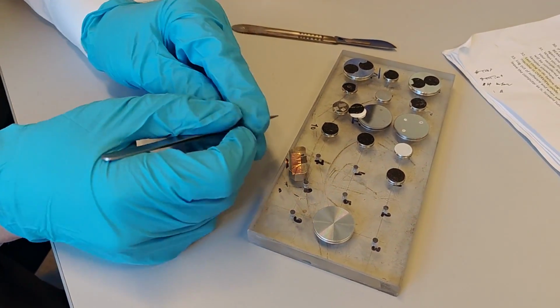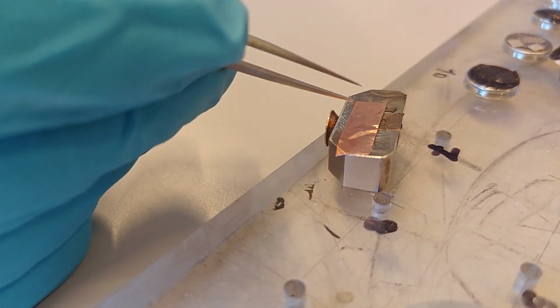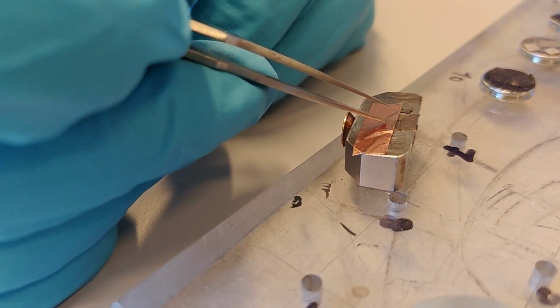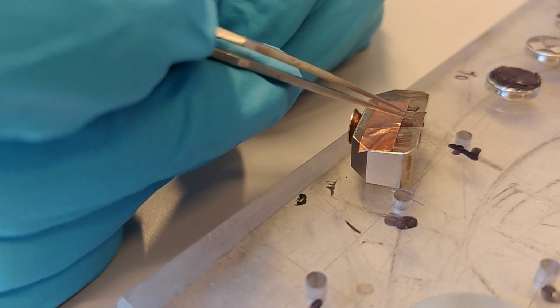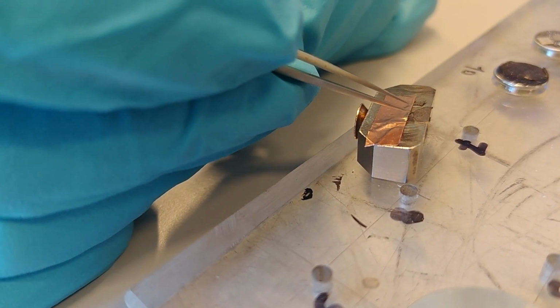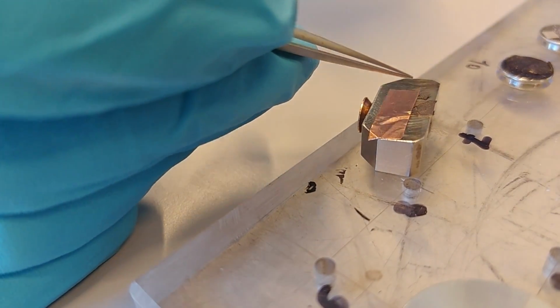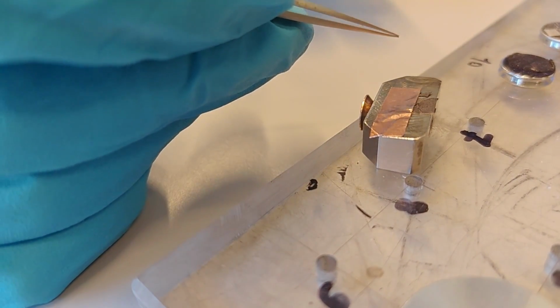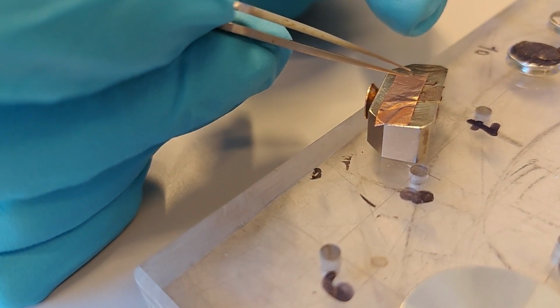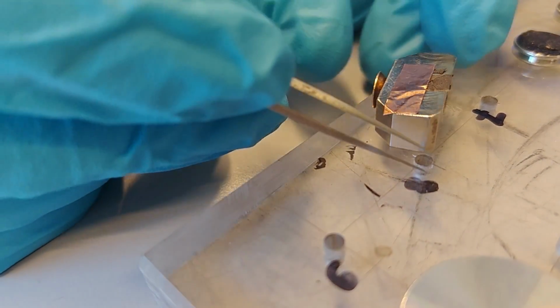So what we see here is this big metal piece, which is just the back support to keep it tight against the mask in the cross miller. And the sample is the black piece that we have here. The sample in particular for today is electrode coated on paper. So the electrode side is facing upward. Your interesting side should always be facing against the titanium mask. That is upward in this picture. We just fixated it with this tape piece.